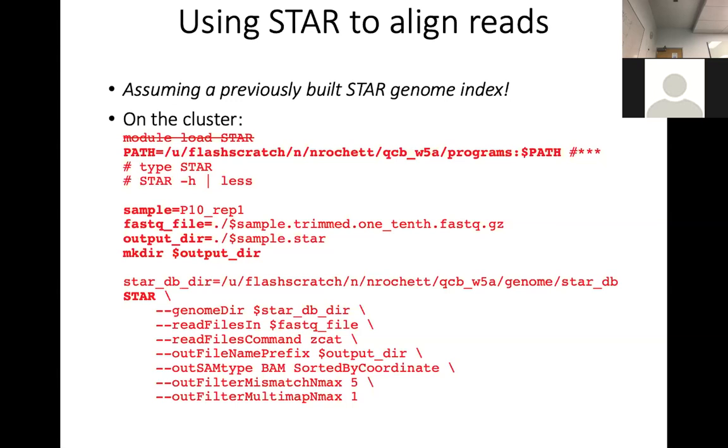Stable. This is your... I don't know. Yeah, it doesn't matter. It just became this way for some reason. Just go back to star. Pretty much just do the same thing. Cool. And then type star. Just star.